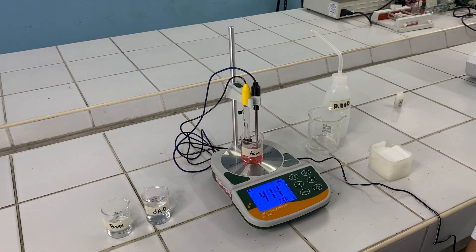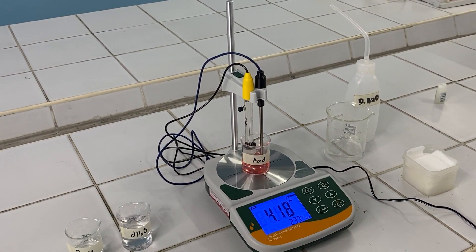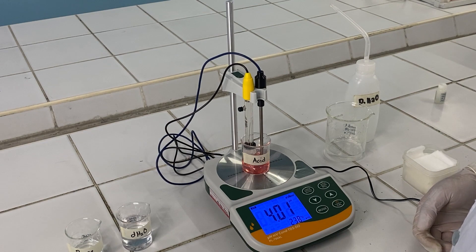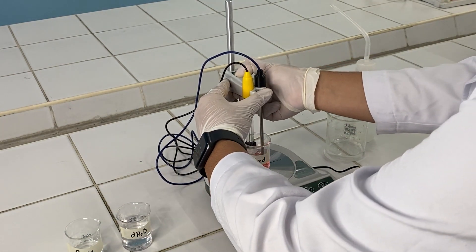Wait for the pH meter again to stabilize its reading. Once stabilized, record the reading, then ascend back the electrode.